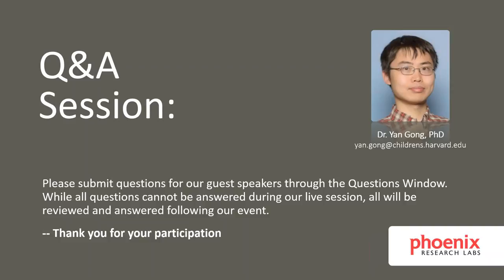Yeah, I can take this. Thank you for the question. The apparatus, the image-guided laser photocoagulation system, is the same for both the Micron 4 and the Micron 3. The actual minimum size is 50 microns, and that's based on the diameter of the fiber that we use. So it will be exactly the same for both systems. Great. Thank you. I'm sure the audience will be happy to hear that.